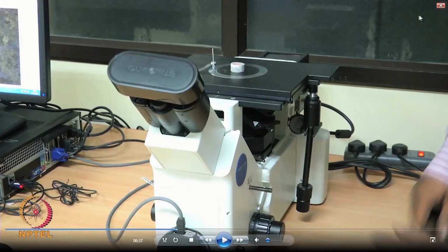I hope you appreciate this demonstration, how the polarizer and analyzer give a better contrast as compared to the bright field illumination, and we will look at the other variant of the microscope, like differential interference contrast, in the next class. Thank you.